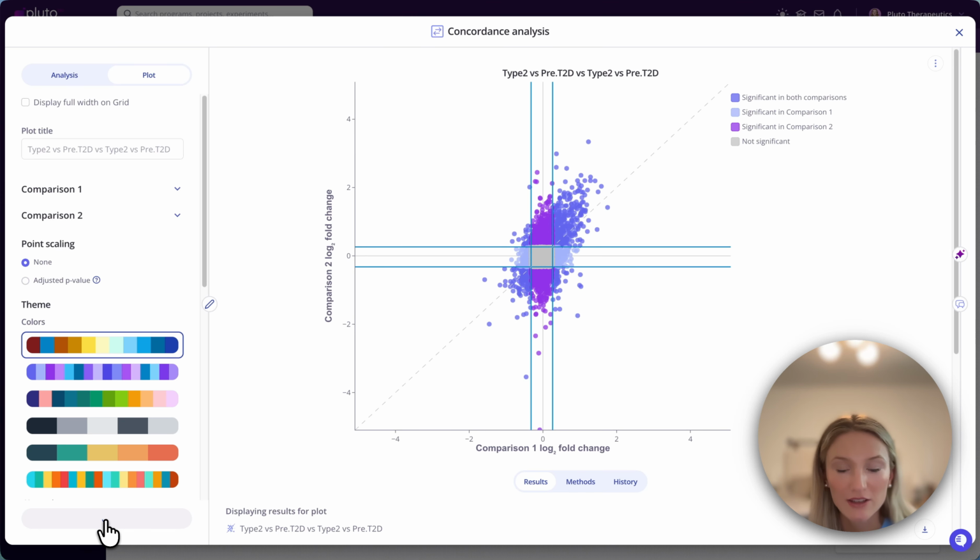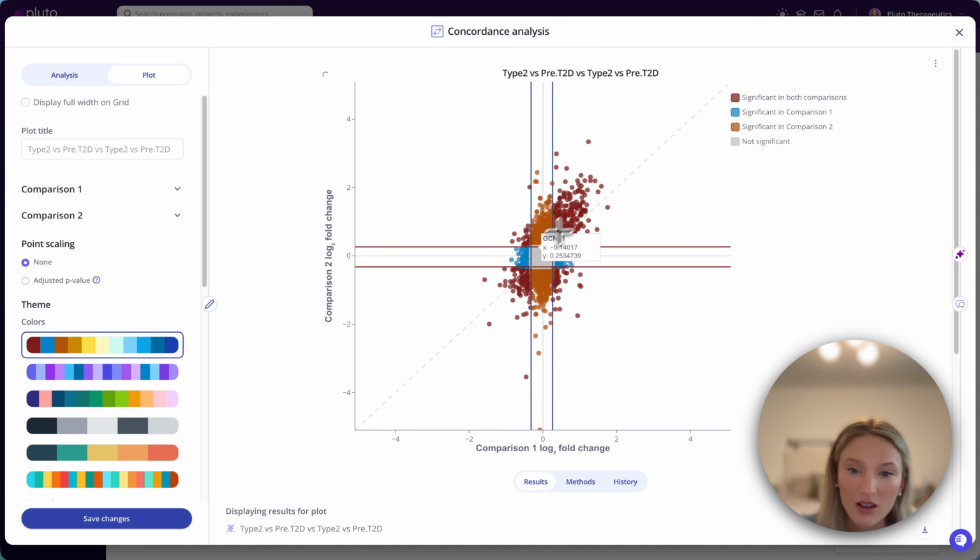And the genes that we're really interested in here are, typically, the ones that fall along the line of equality that show us genes that are shared across data sets. So this is really interesting to us if we're asking the question, is the RNA expression a good proxy for the protein expression? But we may also be interested in seeing if there are any genes that have post-translational modifications. And so the RNA and the protein are not concordant in that case. So depending on which question you're asking, there are different groupings of genes that may be interesting to you.